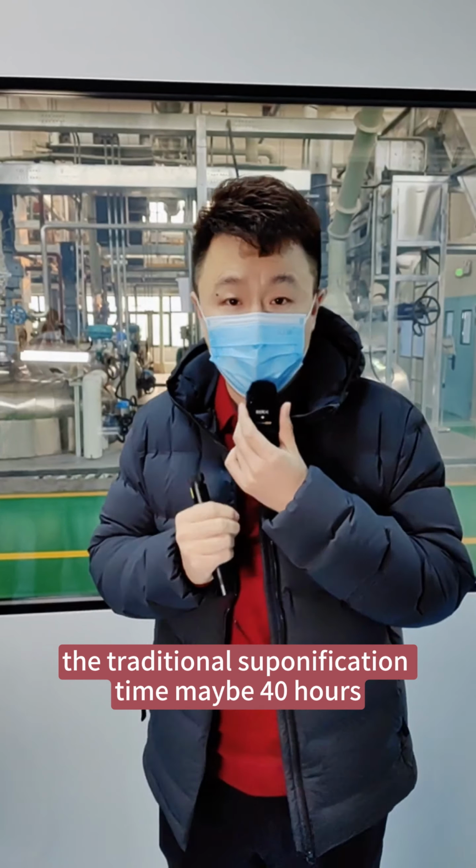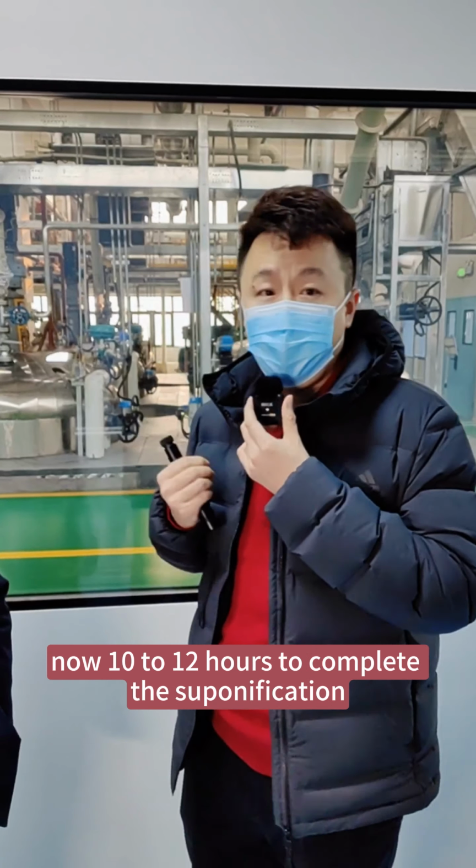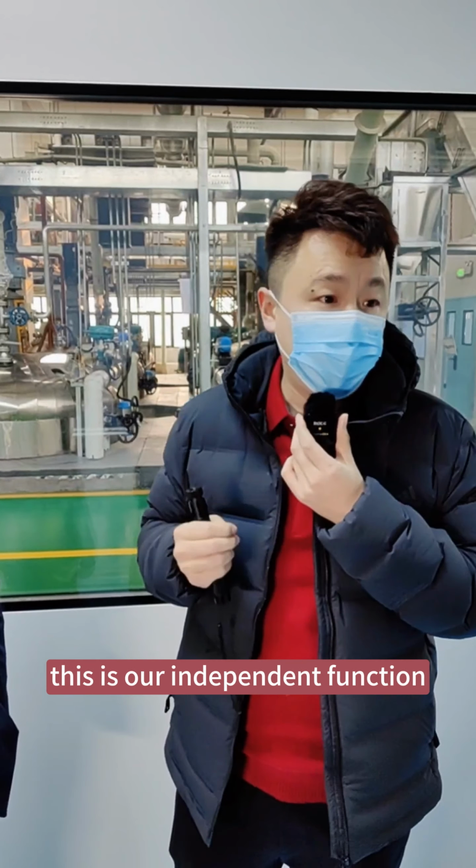The traditional saponification time may be 40 hours, 50 hours, you see. Now we have high efficiency. Now it takes only 10 to 12 hours to complete the saponification. This is our independent function.